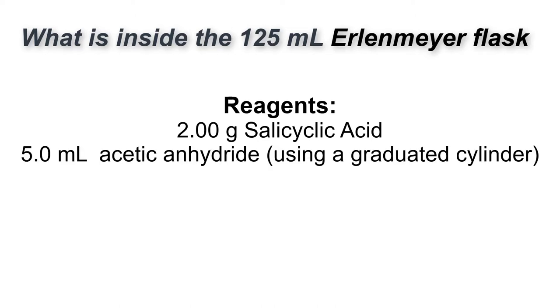We need to be extra careful with the acetic anhydride because it's a lachrymator. It can burn or irritate our nostrils if we breathe it in. That is why when we're measuring out the five mL, we are doing this in the hood, and we want to work with small amounts of it as well. It can also irritate the skin.